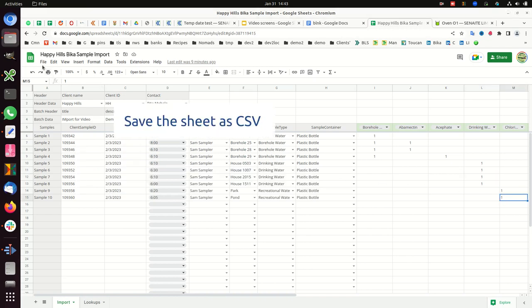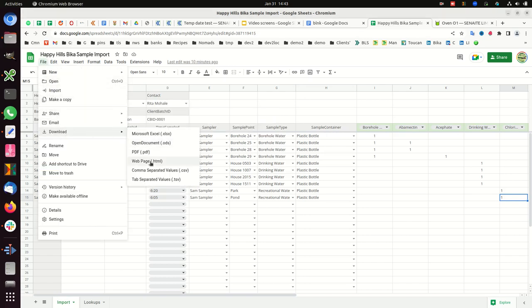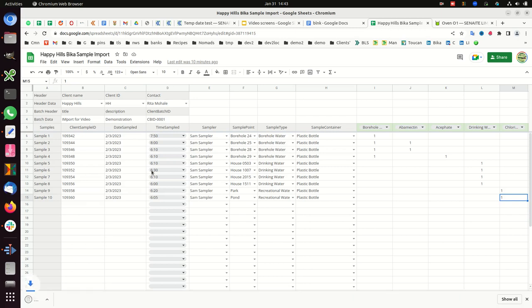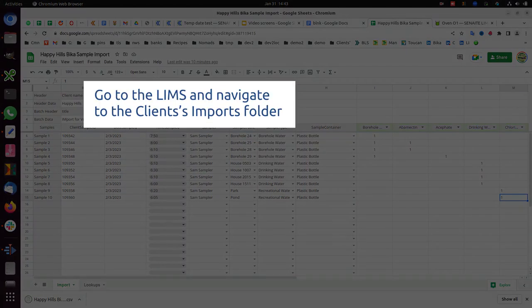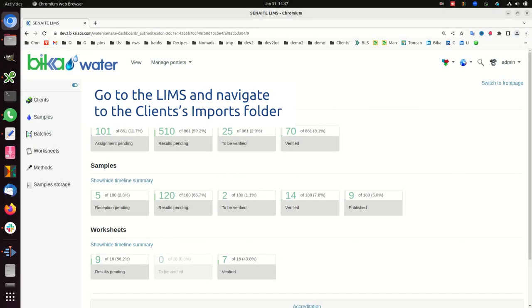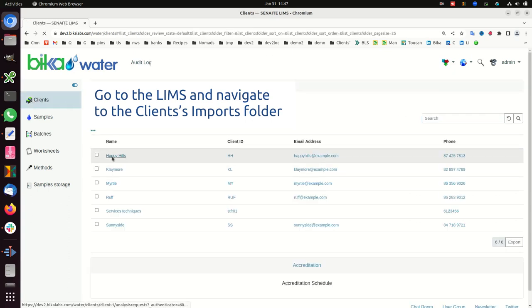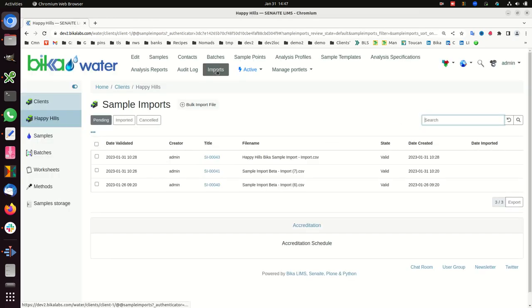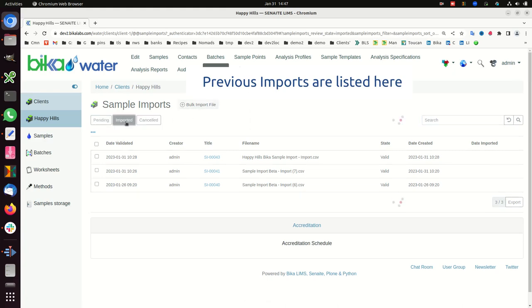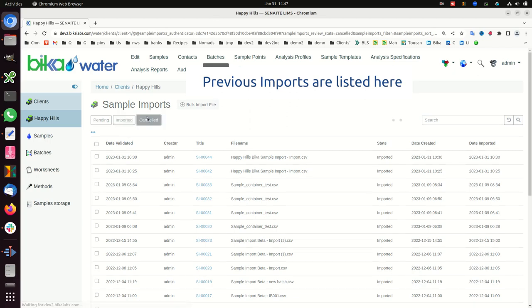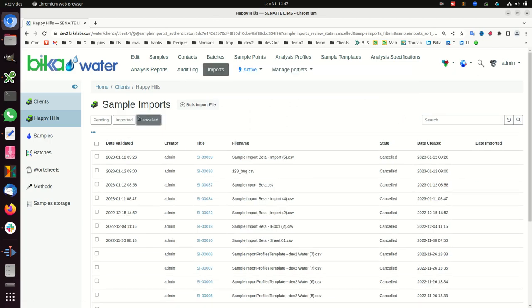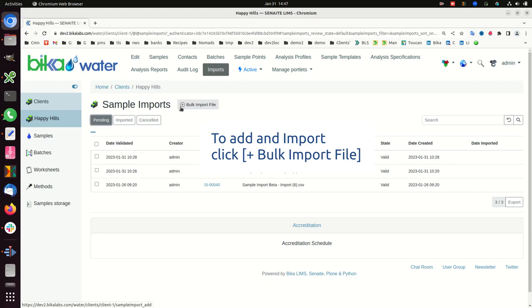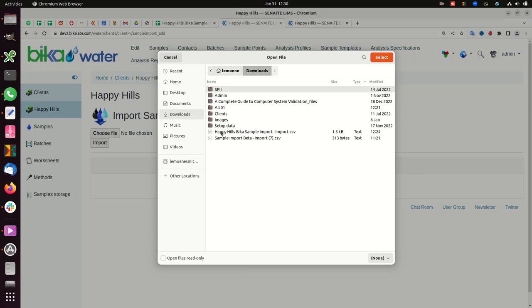Save the sheet as CSV. Go to the LIMS and navigate to the client's imports folder. Previous imports are listed here. To add an import, click plus bulk import file, select the CSV to import.